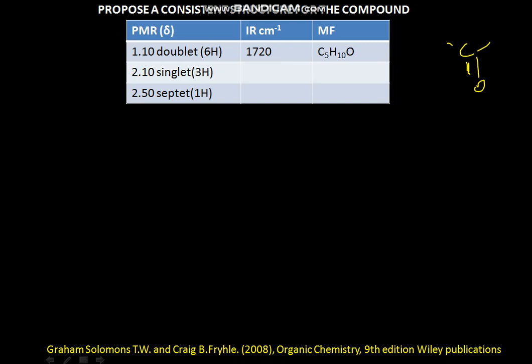And before going into the proton NMR, one needs to know the presence of a double bond or a multiple bond or maybe a ring, or everything together. To know that, it's better to solve the hydrogen deficiency index. Now how is this hydrogen deficiency index calculated? Hydrogen deficiency index is equal to 2C plus 2 minus hydrogen, divided by 2. The C represents the number of carbons.